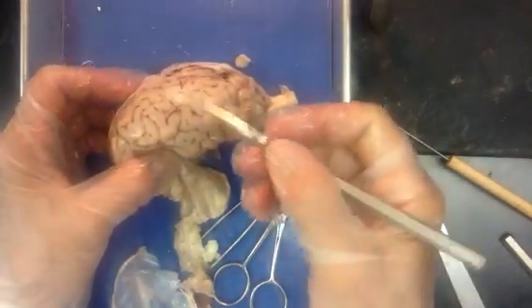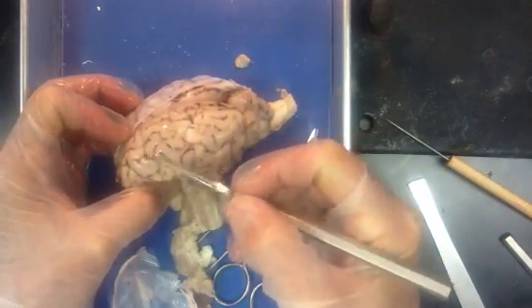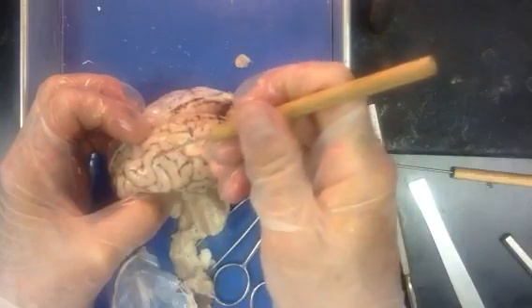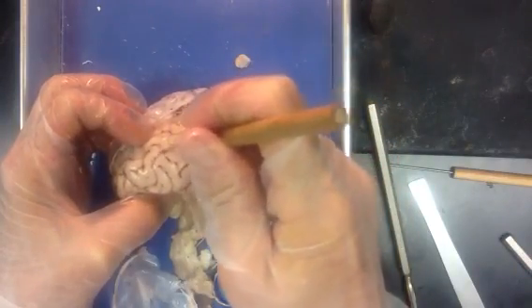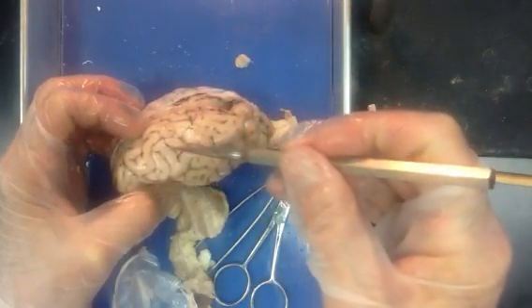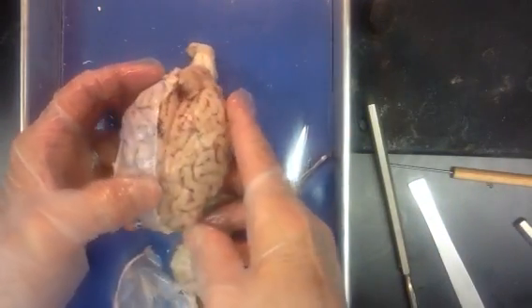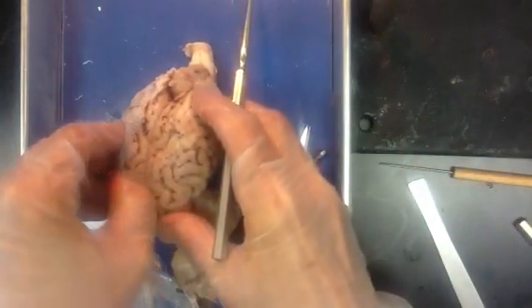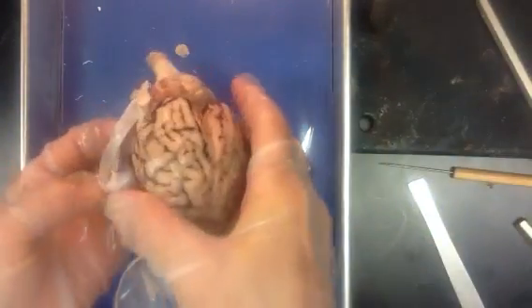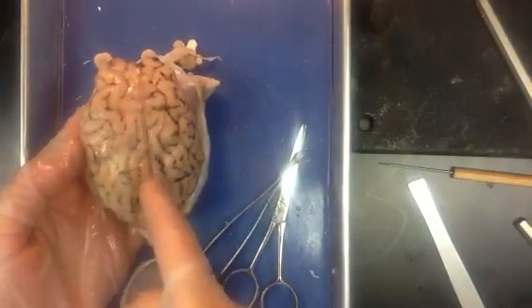We call these raised areas — little hills — a gyrus for a single, or gyri for the plural. We call the little spaces down in between the grooves a sulcus for singular, or sulci for the plural. We have some bigger grooves on the brain surface. The major groove that divides this longitudinally is called the longitudinal fissure. Sometimes it is also described as the commissural fissure, because it is the crack just above the bridge between the right and the left hemispheres.